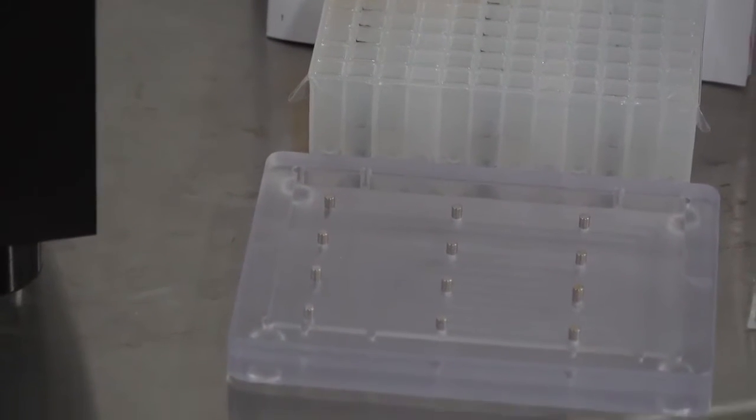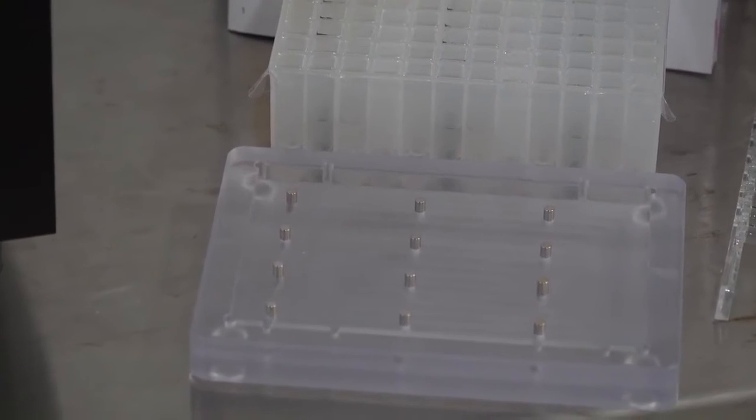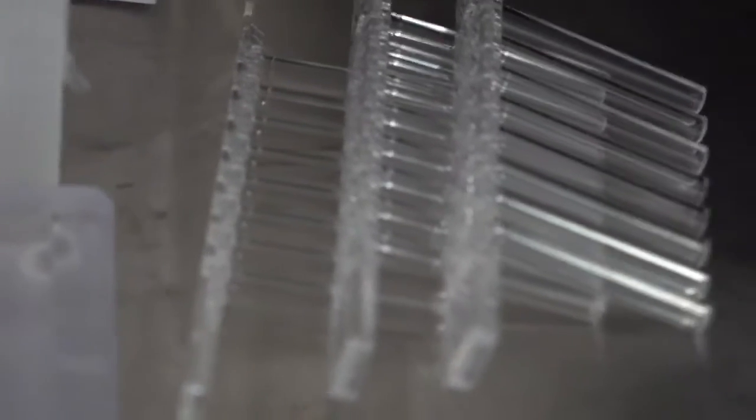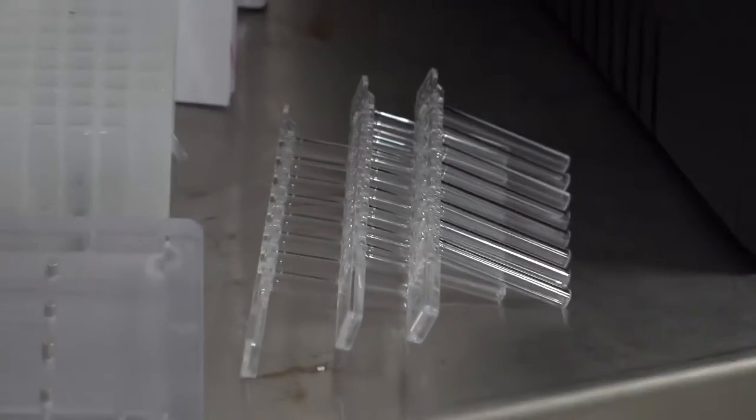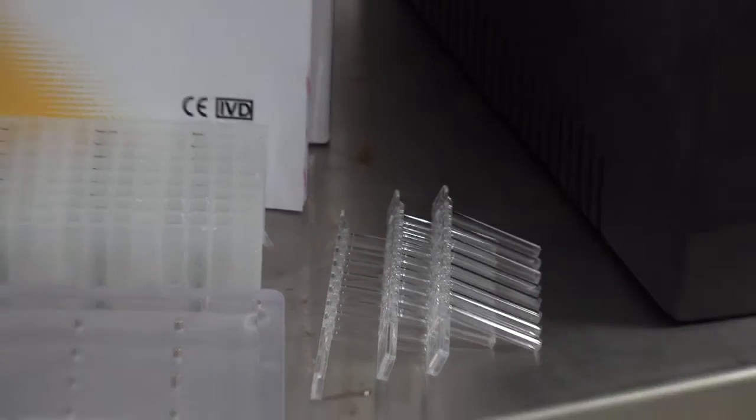The extractor also comes with a magnetic plate so upon completion of the extraction procedure these magnets which are neodymium magnets can withdraw the extraction magnetic beads to the bottom of the plate so that you can safely withdraw the sample. In addition to this we have these specific strips which will be part of the process of extraction and then we have the calibration plate.